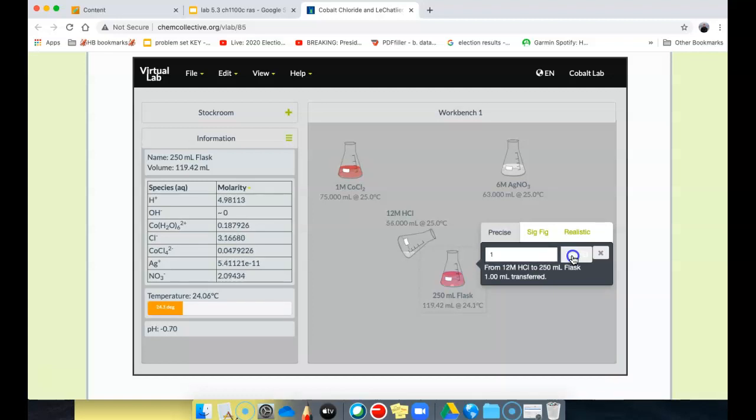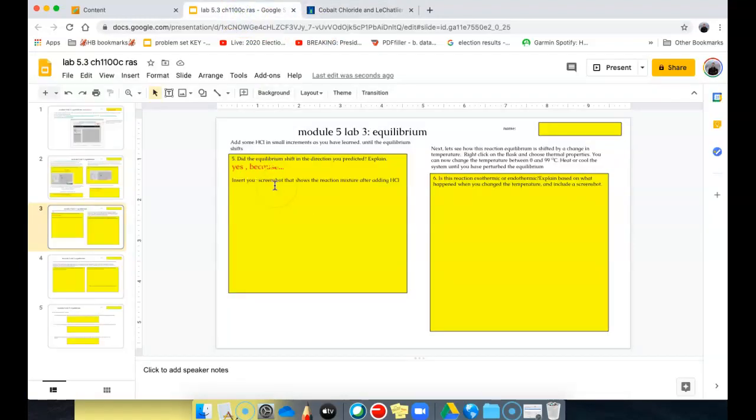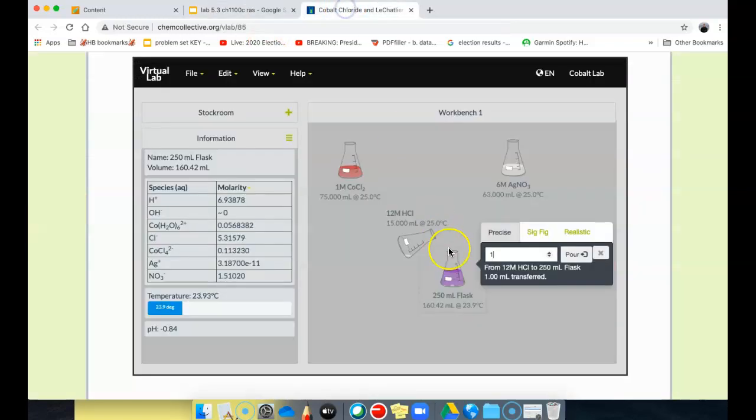Ooh, it is. It's a beautiful thing. I think I'll wait until it turns bluish. Close enough for me. I went all the way from 98 to 160, so I'm just going to record that it was 62 mils. And it says insert your screenshot, so I will.